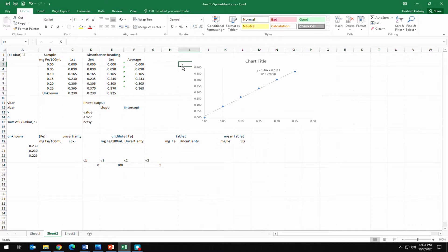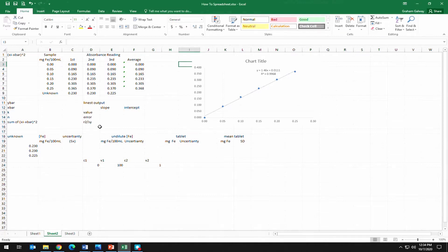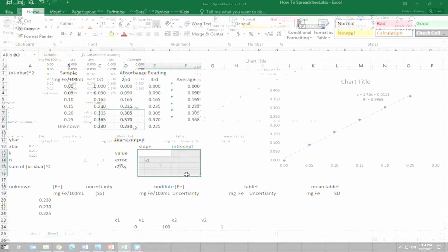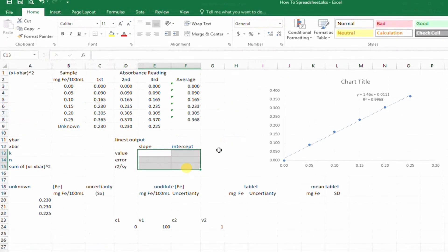I'm not going to take the time to clean this up by adding a proper title for the chart and axis titles — you'll need to do that yourself. I'm just trying to keep this tutorial moving quickly. The next thing we need to do is get the output to the LINEST table.